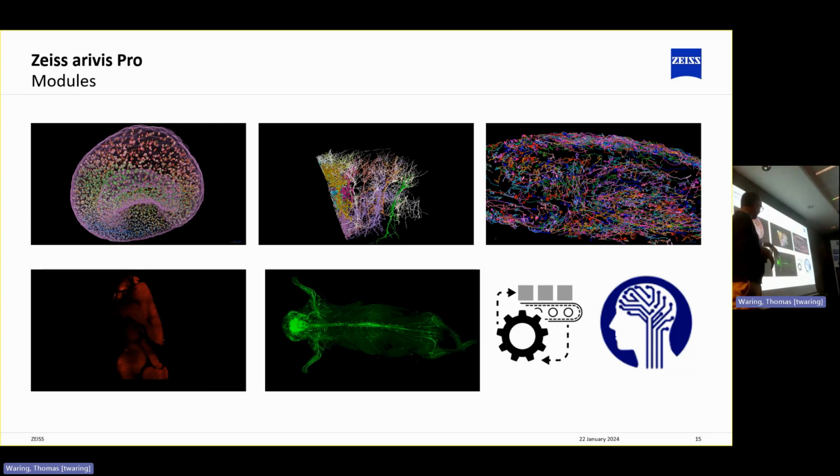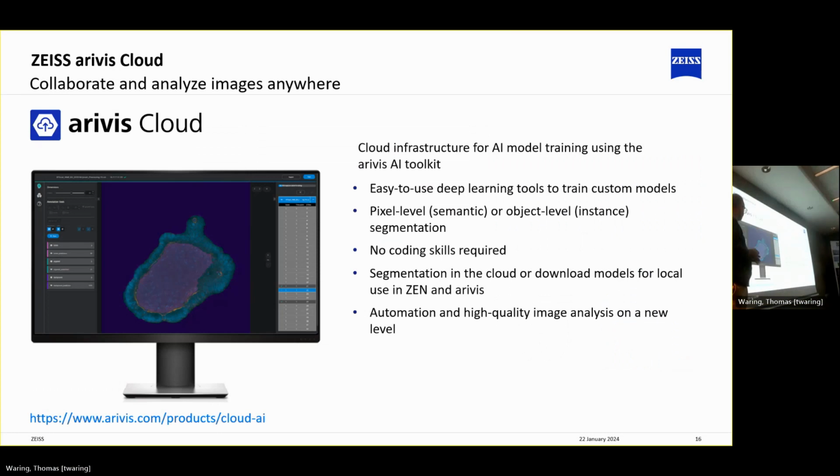The last one is the volume fusion. This was light sheet data, not a Zeiss light sheet, another light sheet, where the customer couldn't fit the whole organism into his light sheet. So he actually imaged this in 8 different parts. The limbs and the head were all imaged separately, and the volume fusion brought it together in some kind of 3D volume stitching algorithm. So all these tools can be plugged in, but the main tool is the 3D analysis, visualization, and processing tool.